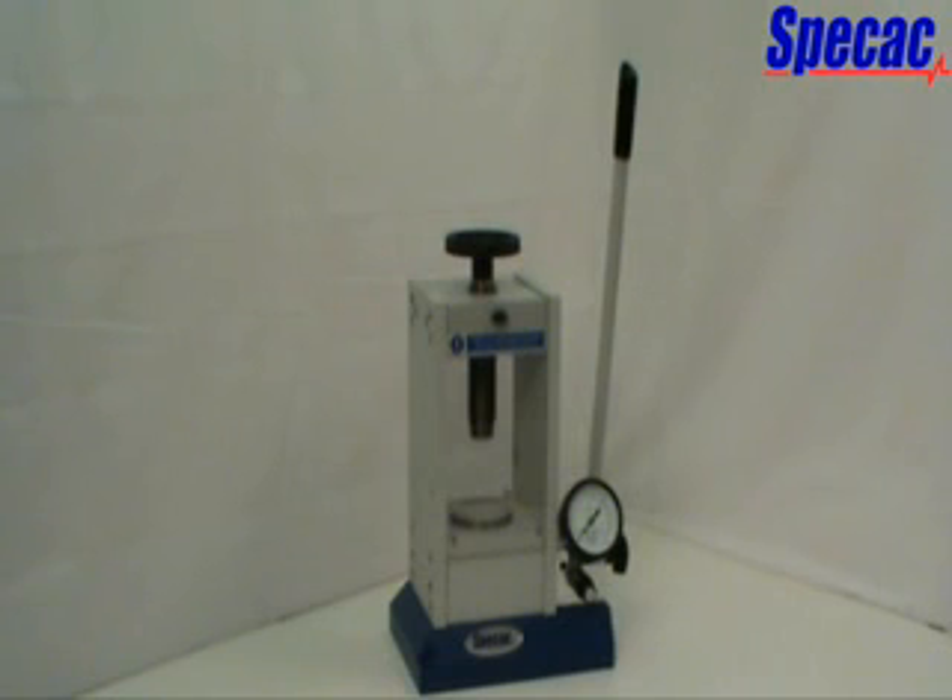For solid samples that need preparation prior to infrared or X-ray analysis and measurement, this press can be used with compatible pellet dies or adapted for use with heated surfaces and filmmaker systems available from SPECAC.